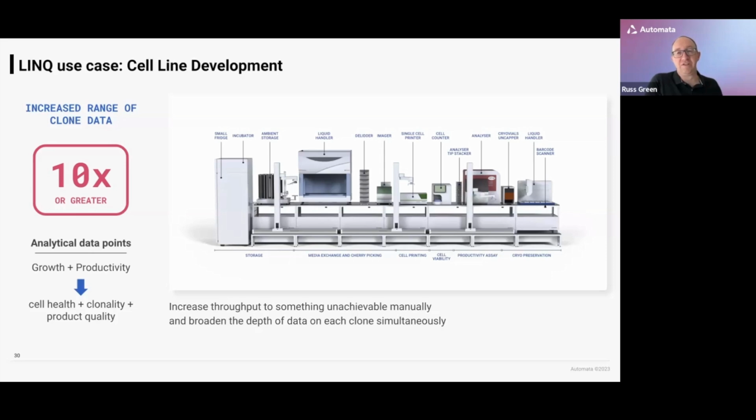On this system, it was really just there to measure product titer, but we also looked at whether we might start adding in analyses around glycosylation or charge variance or things like that, all possible through this kind of device. Finally, on the right-hand side of the system, we also have a further small liquid handler, really just for handling the pooling of cultures of clones into a single cryovial so that we can then store them ready for handing over to the next part of the process.